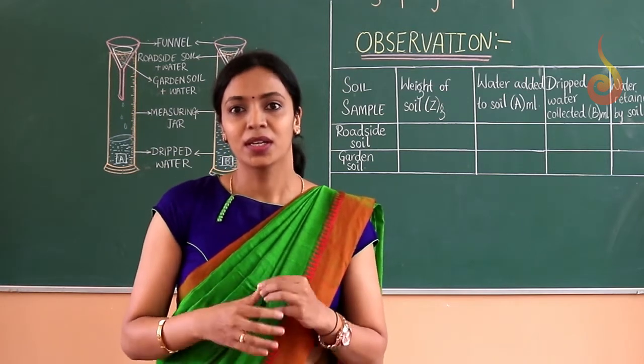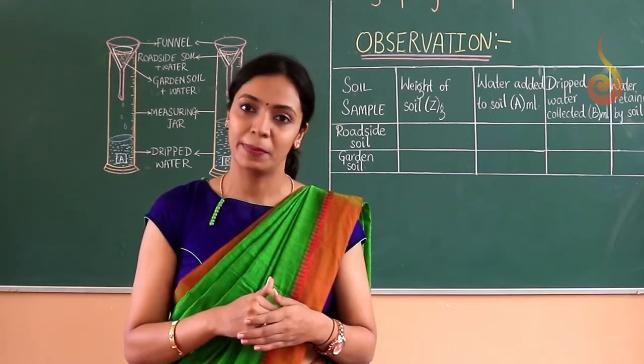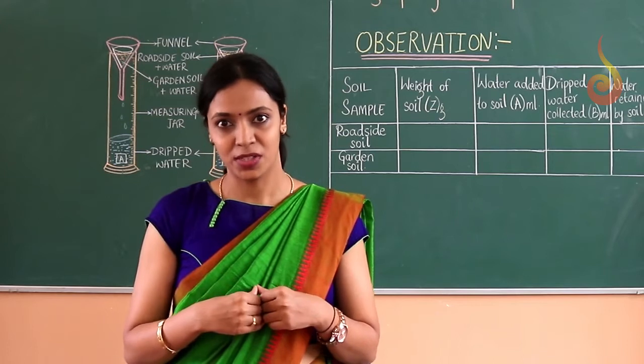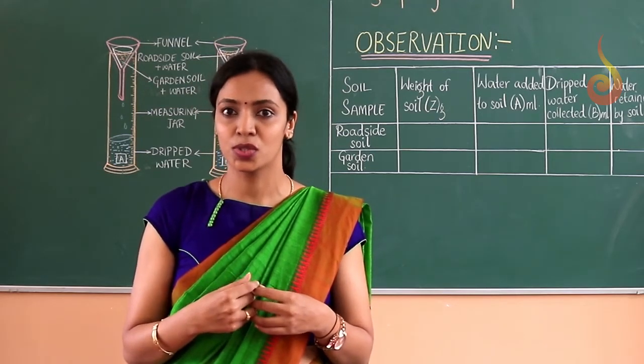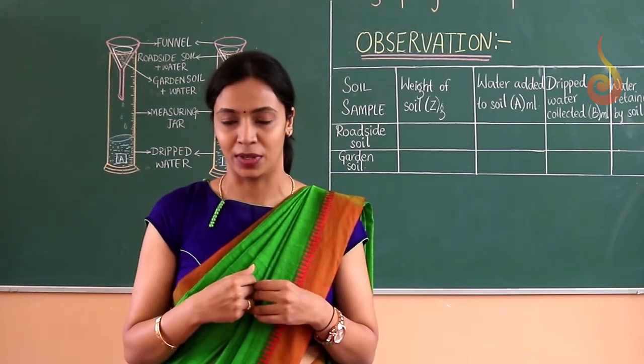Okay? Now, in this experiment, we have two soil samples. We will be testing the water holding capacity in both these soil samples, and eventually I will tell you about what formula you can use to determine the water holding capacity of any given soil sample.